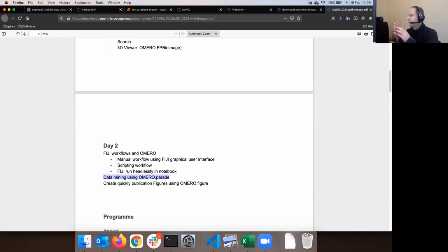So it's kind of like an extended data management, if you want. But that is a step further, because the management, the way how we will find and look at the data is then the analysis result driven, not, let's say, tags driven or key value pairs driven as yesterday.